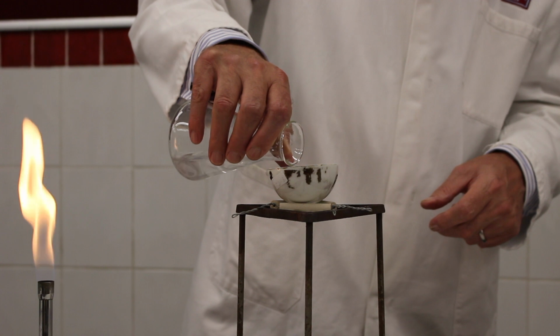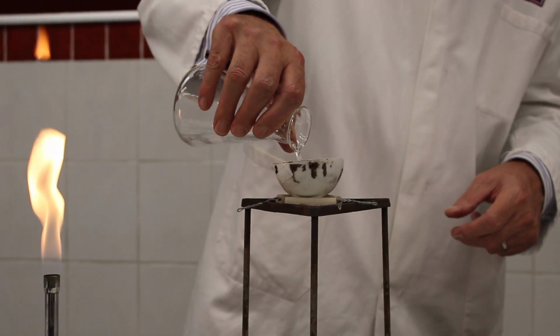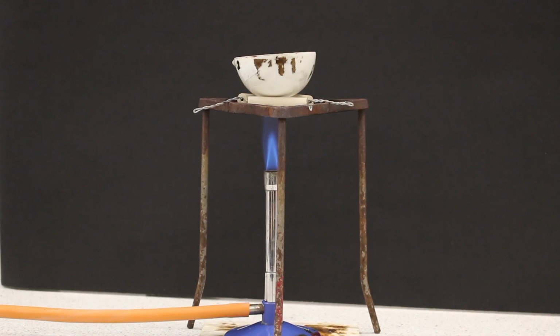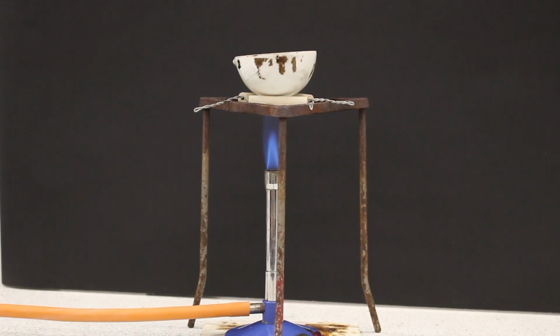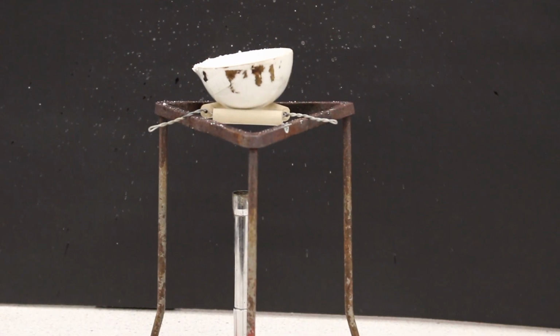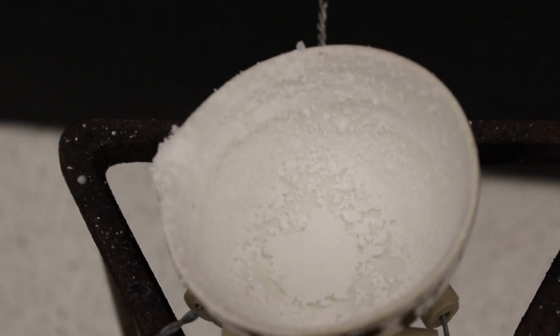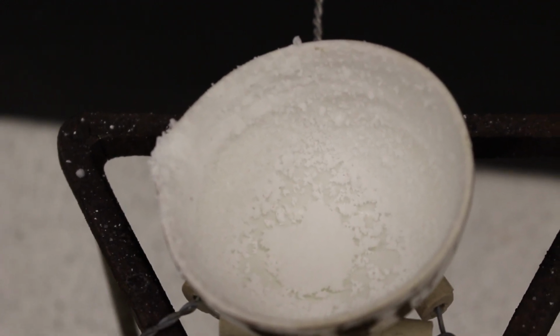Now once he's done this and his solution is fully mixed, he pours the solution into an evaporating basin, and then he just heats up the evaporating basin containing the solution of the soluble salt sodium chloride to evaporate off the water. And when you do this, you'll be left with sodium chloride crystals.